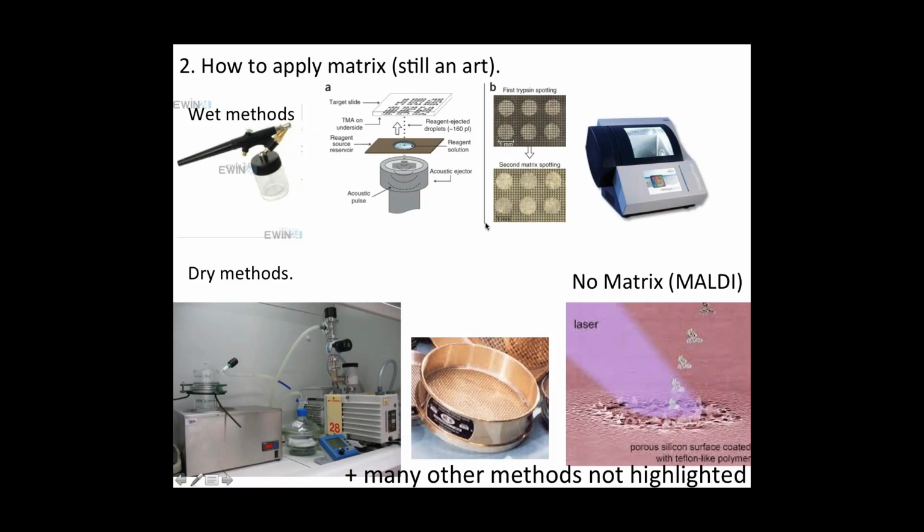We don't have a really good handle of when we should use which one, and what I found out is that it's usually person specific. Some people are very good with this manual spray, and some people tend to work only with the acoustic spray, and some people with these commercial applications.